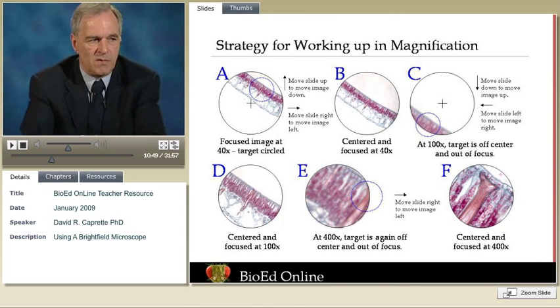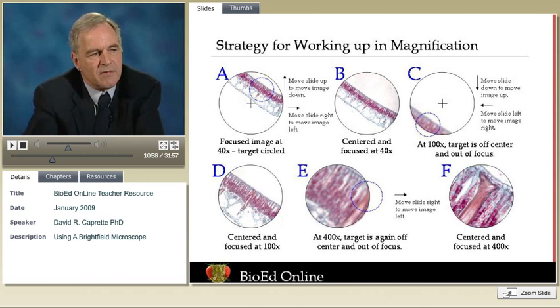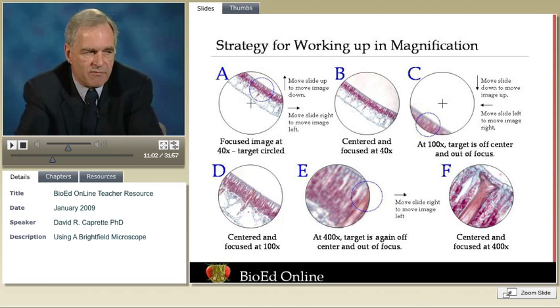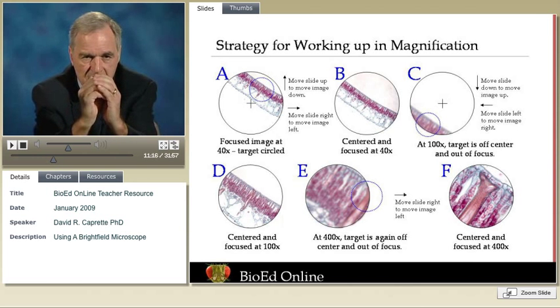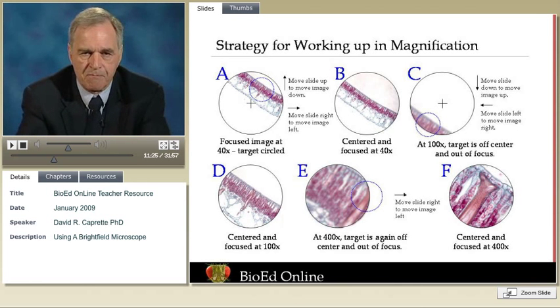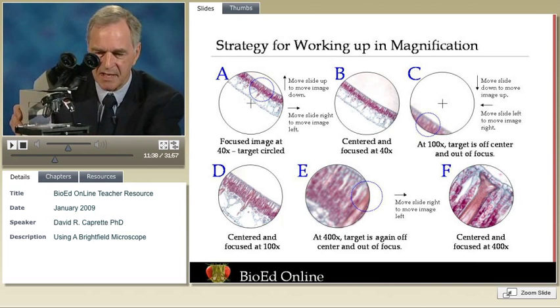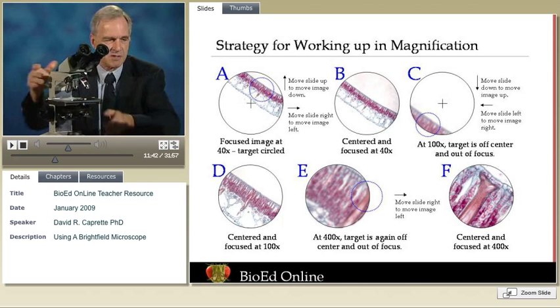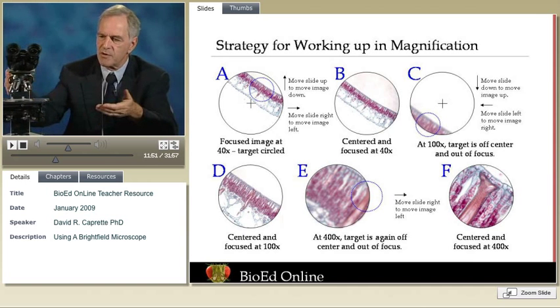When we work up in magnification, we first find our object — in this case, I'm using a stained section of leaf as an example — and then we center up the target in focus. When we're at 40 power, we don't see a lot of detail, but centered in focus we can move up in magnification. At the higher magnification, where we're looking at a much smaller surface area, we should have our specimen there and can focus on it again. We can center it up, optimize lighting and contrast. So going from 40 power to 100, if that's all you need you can stop there. But if you need to go further, again adjust your mechanical stage, get the thing centered up, make minor corrections to the focus. Par focal doesn't mean the lenses are perfectly matched — you always have to make some changes to the focus.